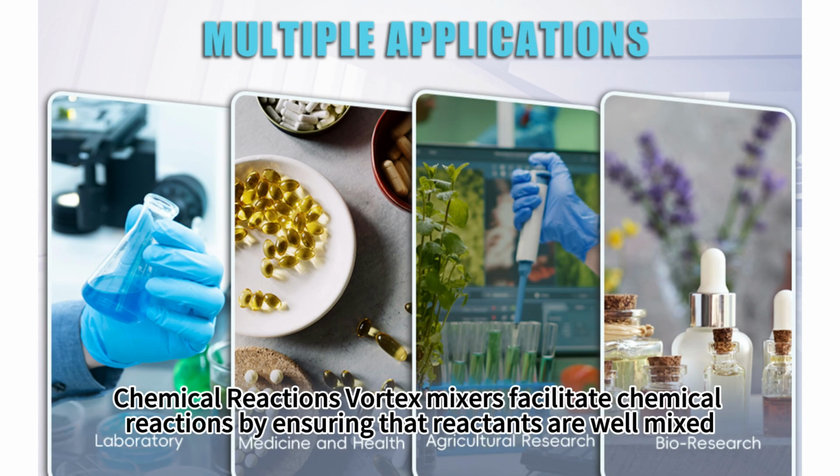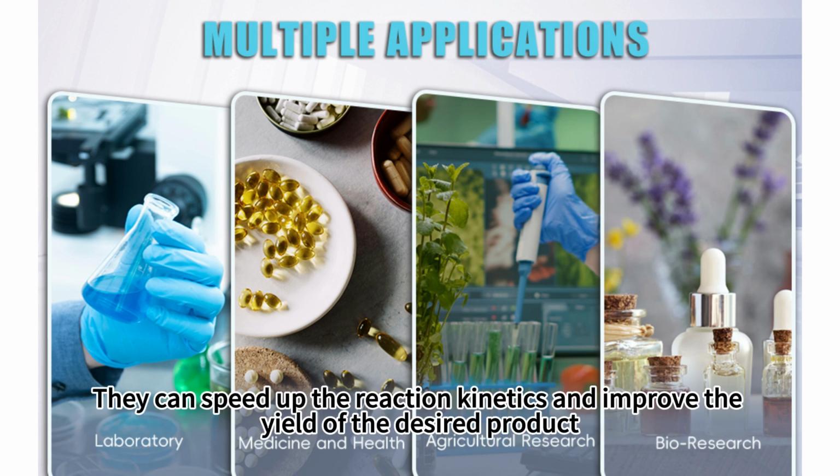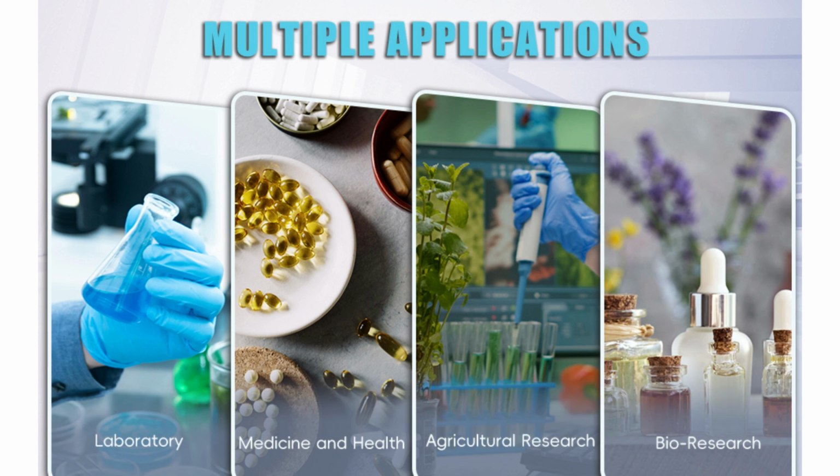Chemical reactions. Vortex mixers facilitate chemical reactions by ensuring that reactants are well mixed. They can speed up the reaction kinetics and improve the yield of the desired product.